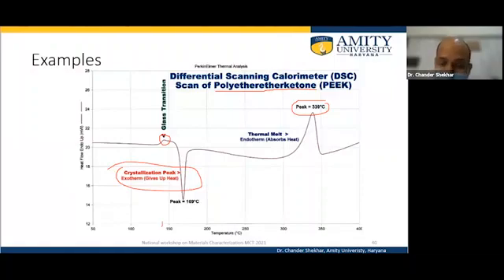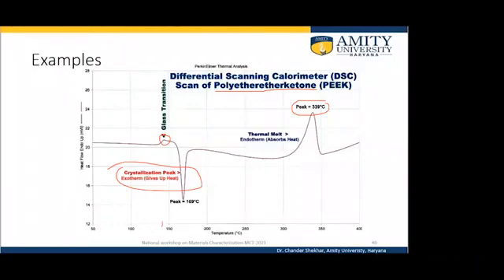How to get the peaks? Whenever there is a transition associated with thermal energy exchange, you will get a peak, irrespective of the type of sample, if it is not volatile. That is correct. So Anand Selvi, you can work on proteins with DSC, and probably get very good data on, say, protein unfolding or protein aggregation and so on.